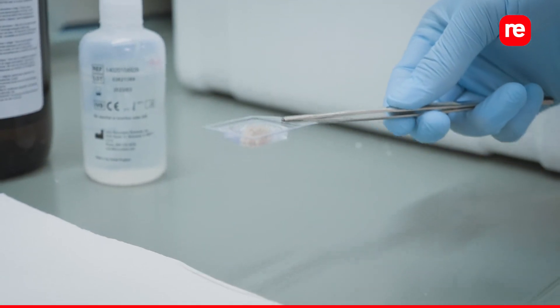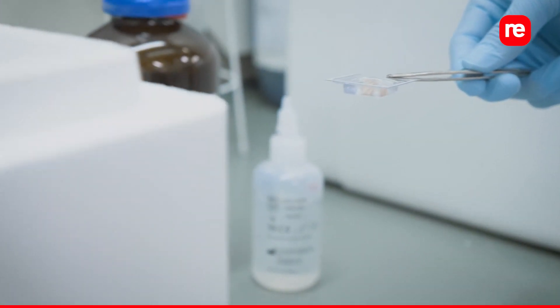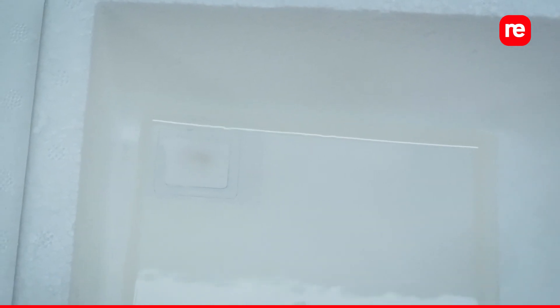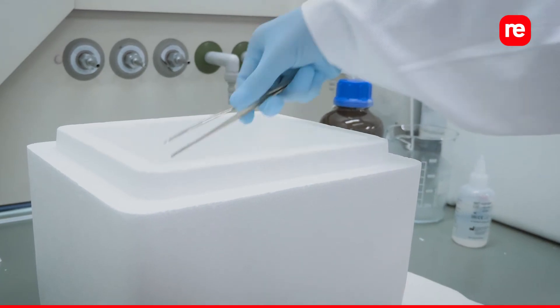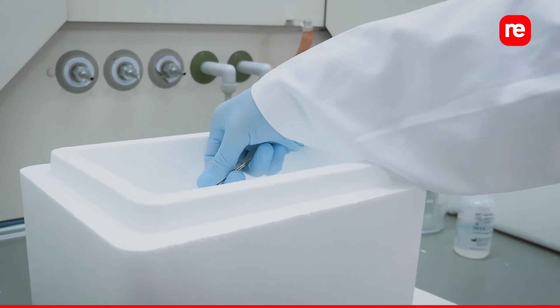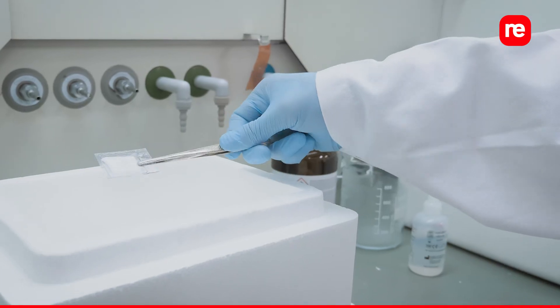Submerge the mold in isopentane for about two minutes until the OCT is completely white. Instead of using a beaker, it can be easier to submerge the sample in a reservoir to keep the OCT in place.